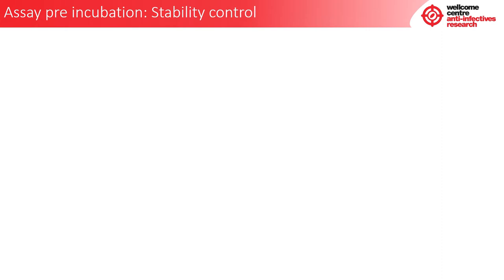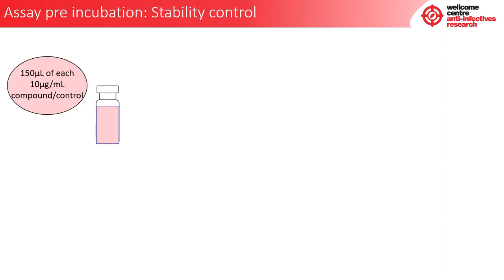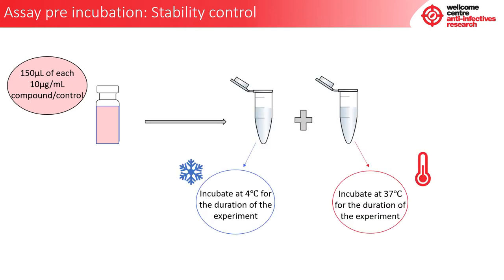Once the left-hand sample side of the dialysis block has been dealt with, the stability controls must be made. To do this, add 150 microlitres of each 10 microgram per ml compound or control into two separate Eppendorf tubes, labelled according to the compound number. One Eppendorf must be incubated at 4 degrees Celsius and the other at 37 degrees Celsius for the duration of the experiment. This is important to check the stability of your compounds during the assay.